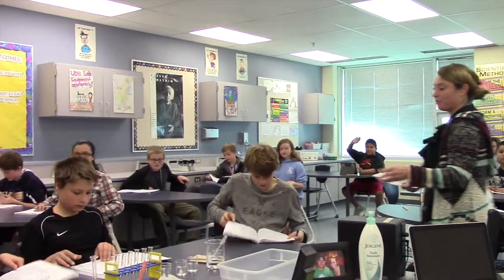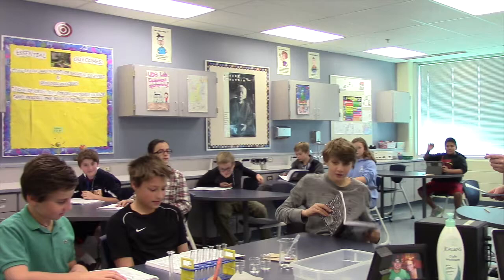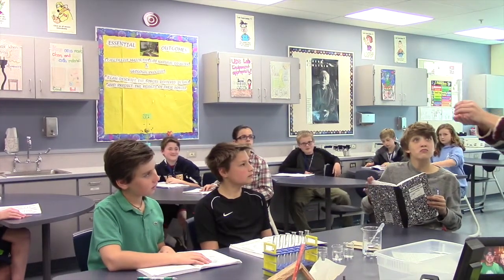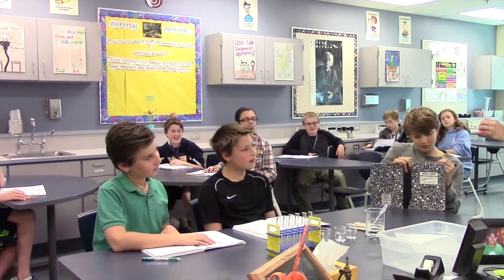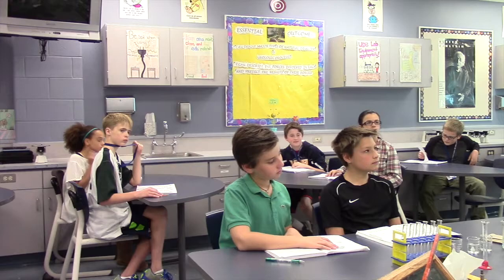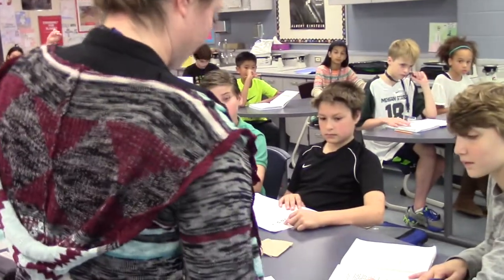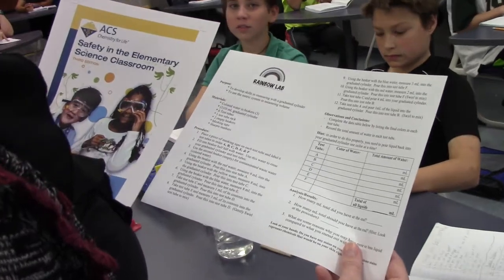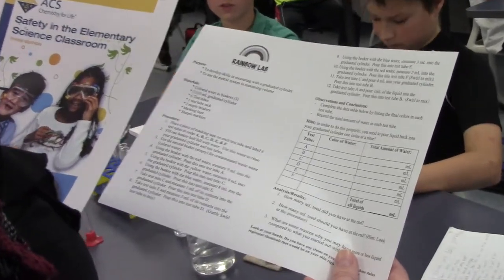Teachers who model safe lab practices and instruct students to do the same will not only avoid injury now, but they will also be better preparing students for lab experiences in the upper-level science classes. Many potential hazards can be eliminated if you are organized and prepared. Always perform activities and experiments yourself before assigning them to students.